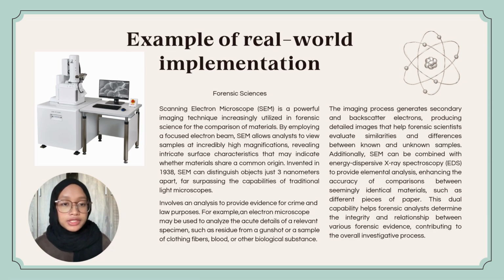The imaging process generates secondary and backscatter electrons, producing detailed images that help forensic scientists evaluate similarities and differences between known and unknown samples.